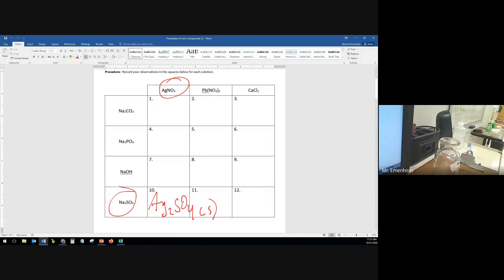Let's cut some more filter paper. This time I'm just going to cut it in half instead of fourths. That way I can get it in the filter. So we need our waste. This one's pretty good, so let's see which one of these is done. This one's not really done now. Maybe if I just put it right there. And then keep those together. Remember that that's the same solution. So let's put our filter paper here.